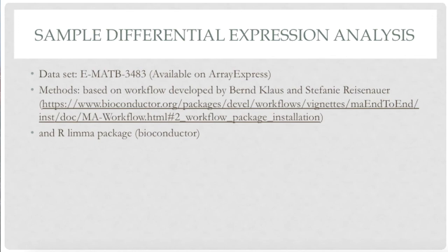And this method that I will introduce is pretty much applicable only to the most basic data sets if you want to copy everything from my code. That's because there will be a lot more quality control and normalization and things like that to be done. Let's say, for example, if you want to look at a data set with more than one independent variable, which is the case for the data set used by these two German researchers in demonstrating their workflow.